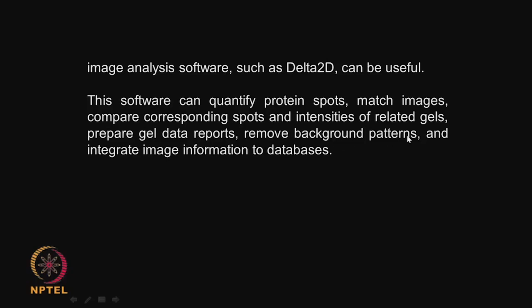If proteins from one set and another set are constant, we could remove them and just see those proteins which have appeared suddenly, or those which have disappeared after a treatment for a particular disease, and then go into databases and try to identify what that could be, or take out these spots.